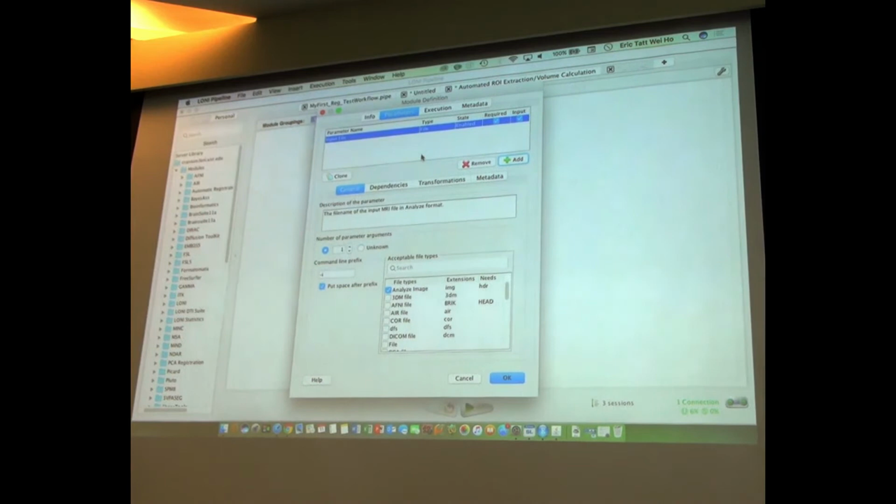It takes one parameter, an input file. Let's just open the content of a file. Simple. Let's do more.